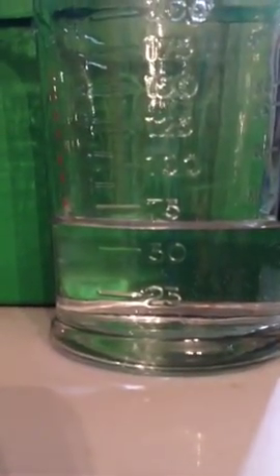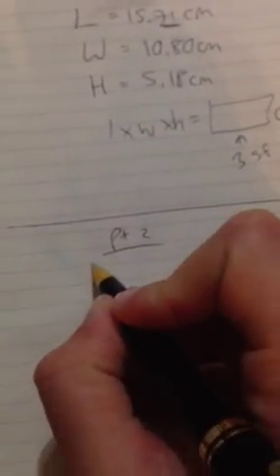So here our measuring device, we can tell it's broken up into groups of 25, which means we can really only guess to the nearest tens place. So I'm going to estimate this has about 60 milliliters of water in it. And I'll write that down. And you'll be including this on your data sheet that you submit for your own measuring devices and your own volumes of water.